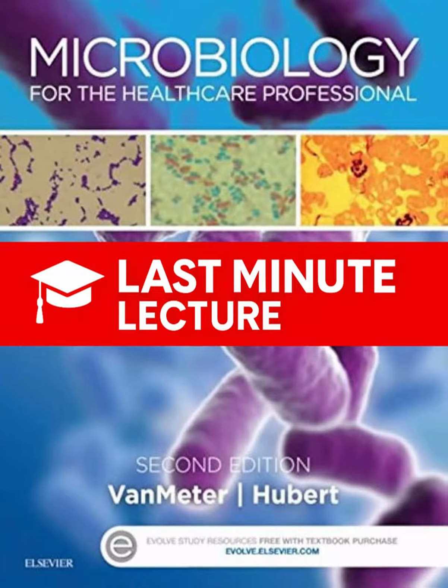Or selects against something. Selective media has ingredients that inhibit the growth of certain microbes while letting others grow just fine. The book uses mannitol salt agar, MSA. It's got a really high salt concentration, like 7.5% NaCl. Most bacteria hate that much salt. But Staphylococcus species, they tolerate it. So MSA selects for staph.